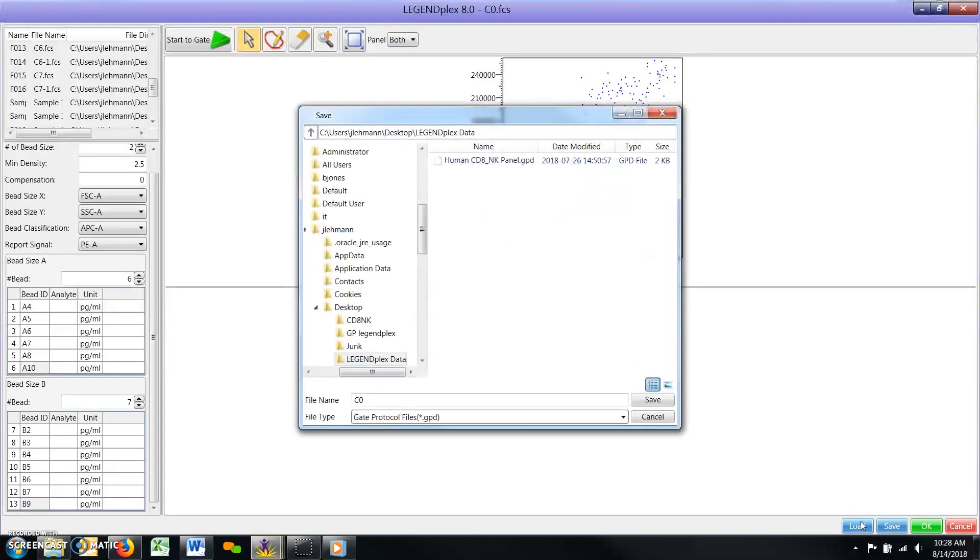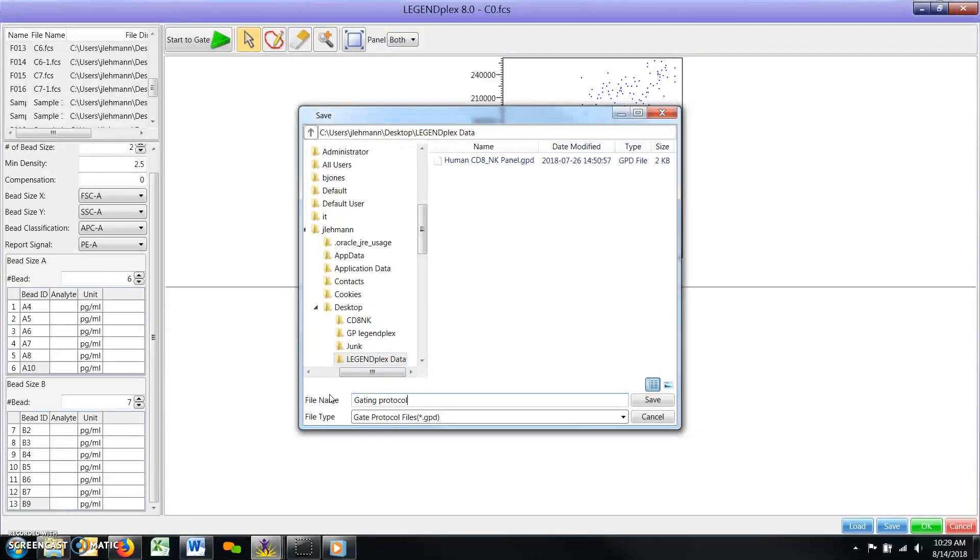For future analyses, when you first enter the gating window, click the Load button, find your protocol file, and then click Open.